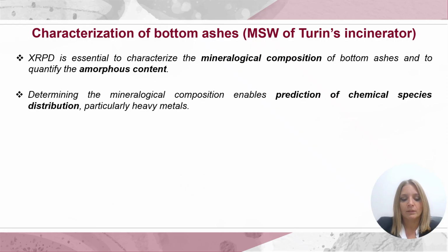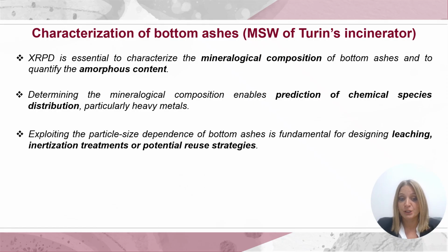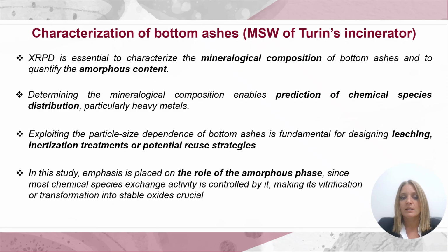Because the determination of the mineralogical composition, obviously with the chemical analysis, allows us to understand how the heavy metals and the toxic metals are inside our samples and how they will react potentially to the leaching. And this is important for the inertization treatments and the potential reuse strategies.